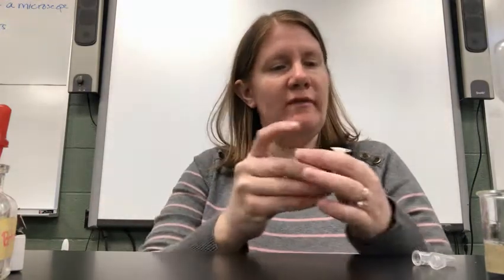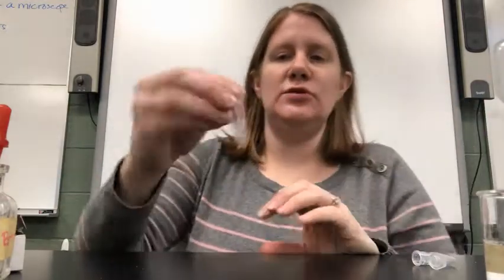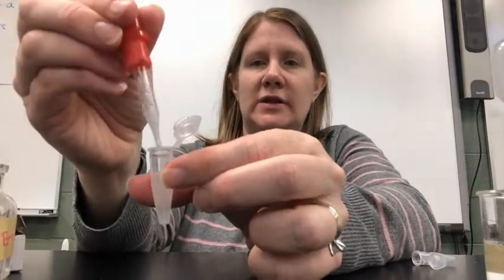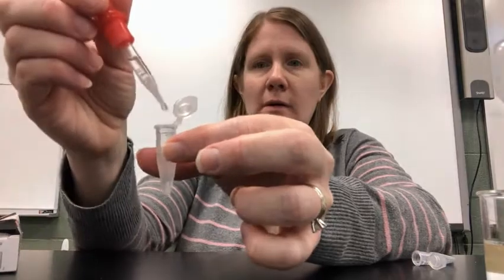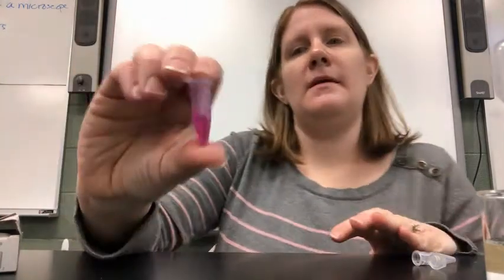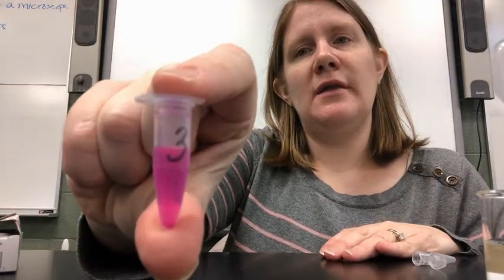Close both tubes. Invert my testing tube. Put a little of the Bertinol solution in there. Oops, need to get a little more. Invert it, and there we can see the results for the 3rd tube.